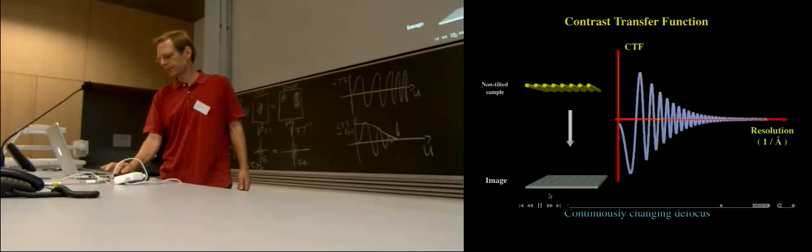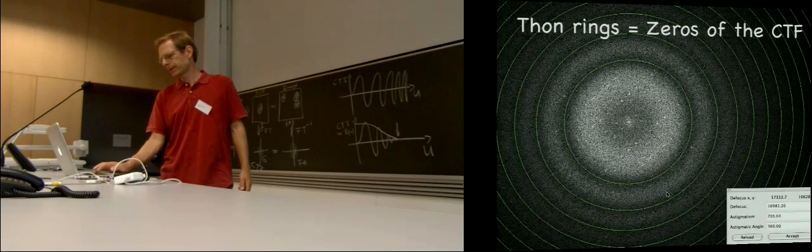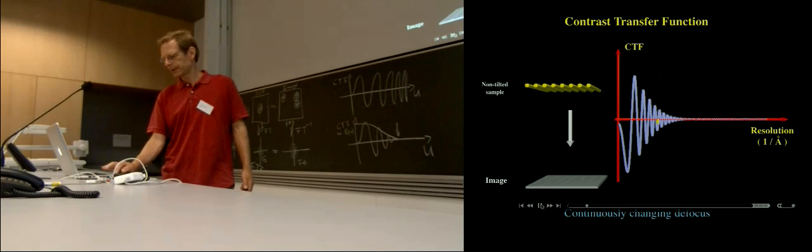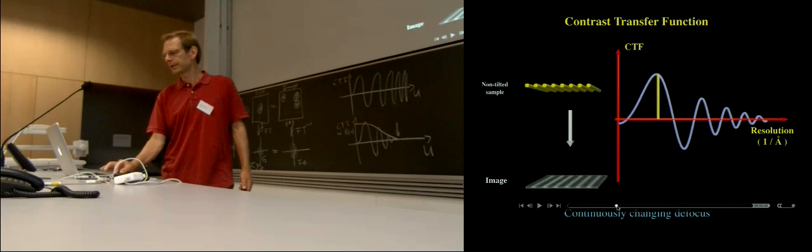Oops, I would have to stop this. So, well, I think you got the message. So we stop this, and we want, I can't do it. Okay, we want this much of defocus for that frequency. Yeah? Then we have full contrast.